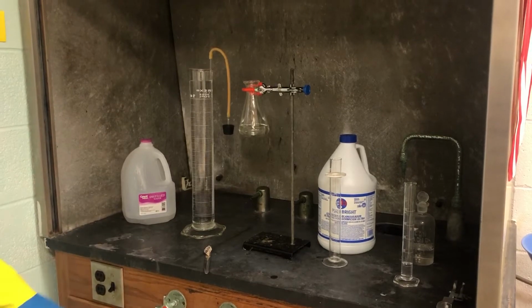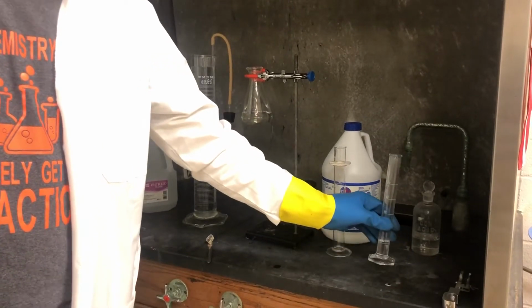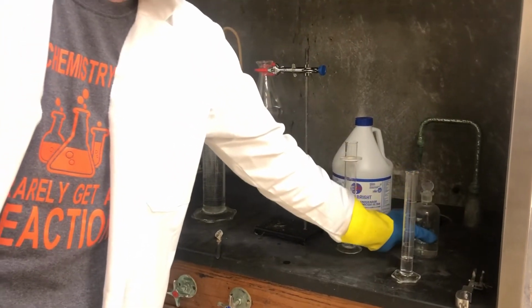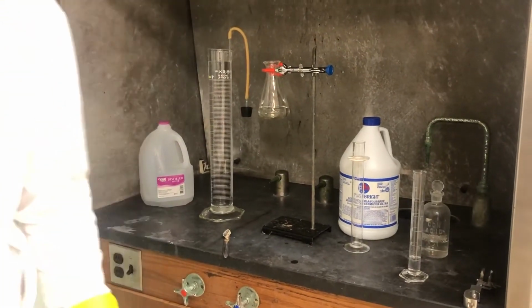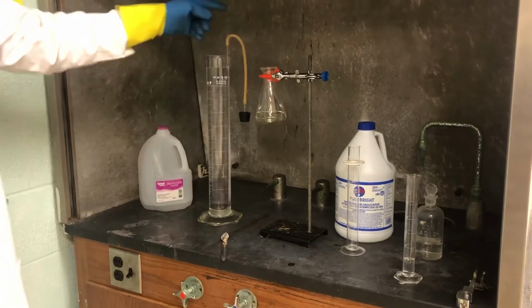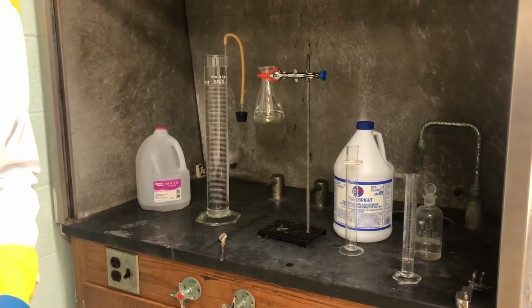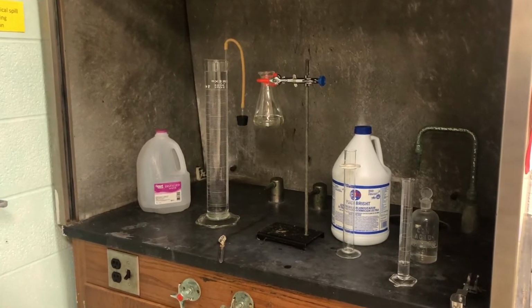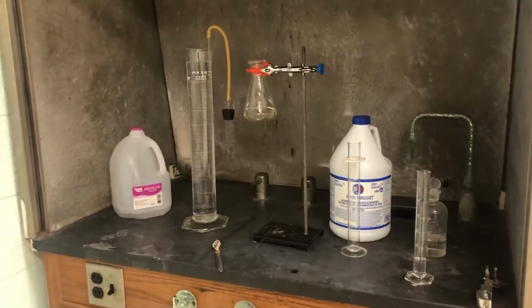All right, so I'm gonna get the lights, then I will pour out of this little 50 milliliter graduated cylinder, which has the hydrochloric acid that I got out of this container. When it does that, it will start generating the chlorine gas here, and that will come into here. Then I will drop this pebble in that, and need to get me an igniter. Well, I think it should ignite itself. That's what we're predicting. All right, so we're going to get the lights. I'll turn off the computer, so we'll have it darkened in here.